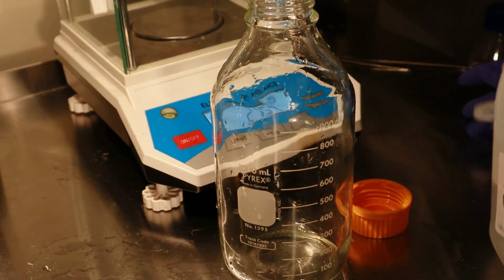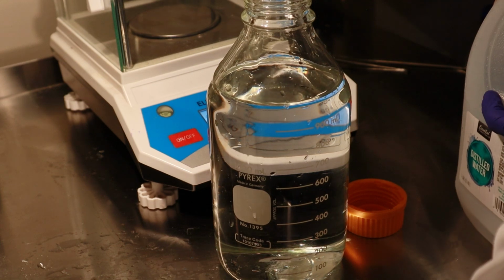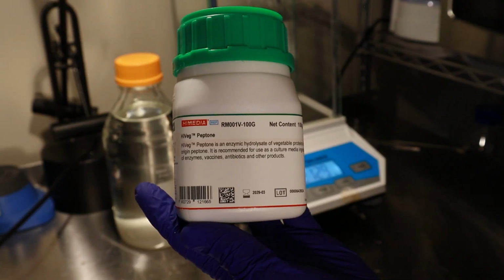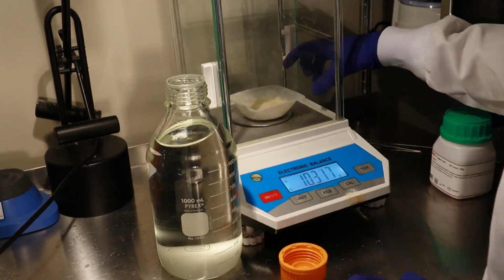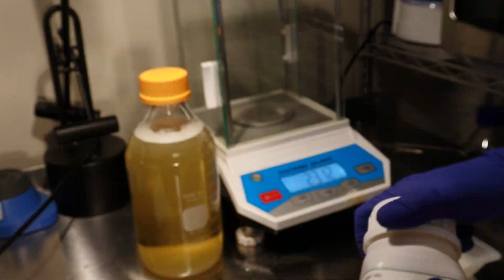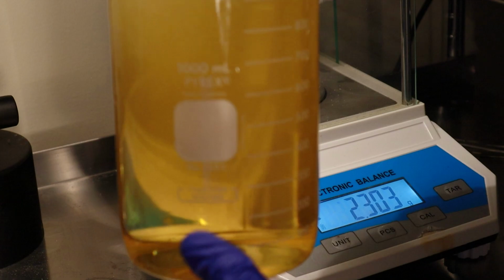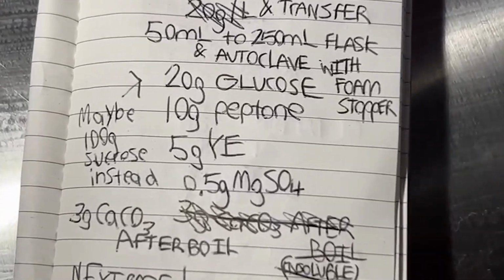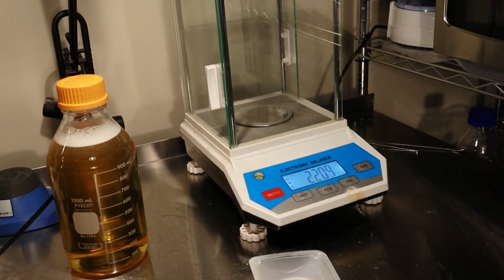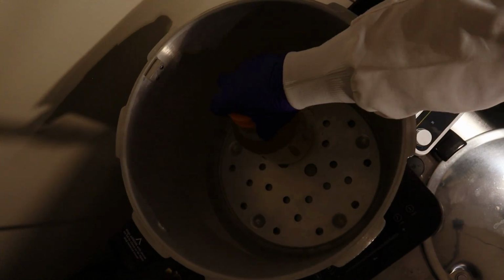I started out by getting a 1 liter media bottle and filled it with 1,000 mils of distilled water. To that, I added 100 grams of sucrose as the carbon source we discussed, 10 grams of peptone as the primary source of nitrogen. I then added 5 grams of yeast extract to cover the rest of the essential nutrients for Streptomyces growth. I shook the bottle until everything dissolved, and while misreading my notebook and missing the line about magnesium sulfate, thinking it's the calcium carbonate amount, I wrongfully added 0.5 grams of calcium carbonate to keep the pH balanced. And after autoclaving, the media was now ready for use.